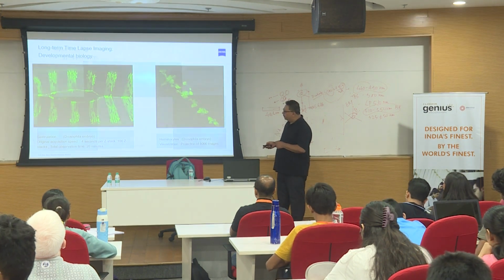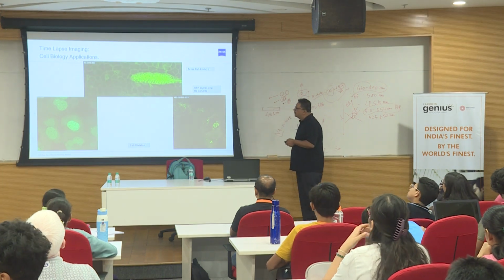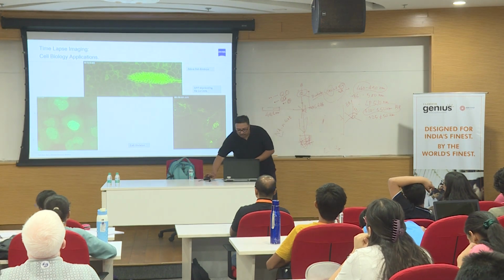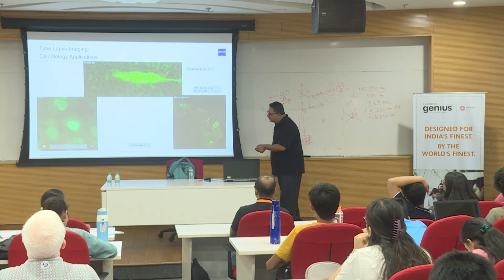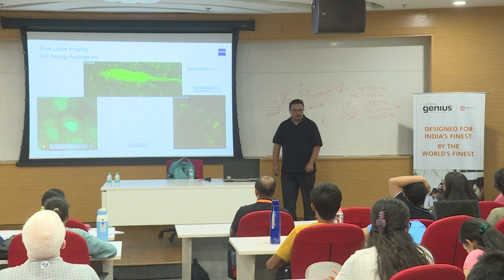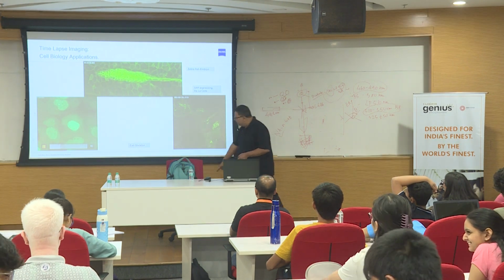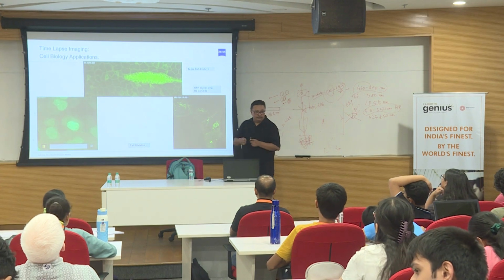If you go further over here, now you see 2 hours of imaging, and this is a zebrafish embryo. Over here you can see the vesicle transport, and you can see the GFP, and this is basically the cell division over here. You see over here. So where was 20 minutes? Where was 3.5 hours? Where was 2 hours? Where is this in minutes? Where is this in seconds? So you see the time resolution, the time stamp.